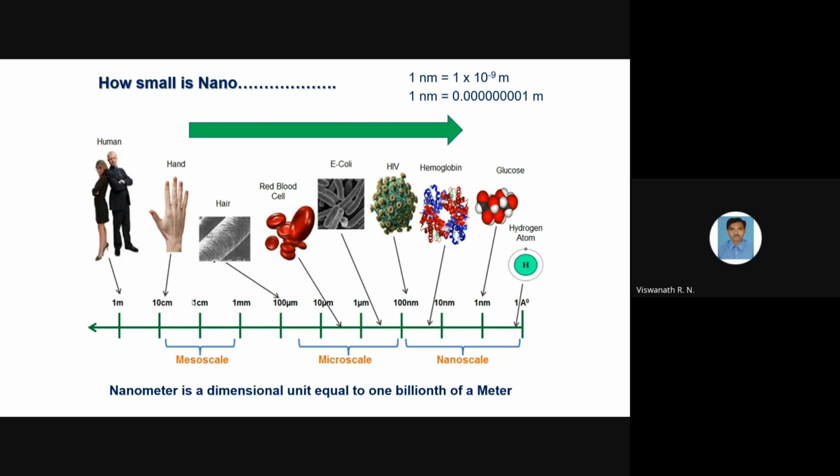So it means our naked eye has a resolution or resolving power which is very low. That is why we are looking at an object in depth, how the molecules or clusters are assembled.